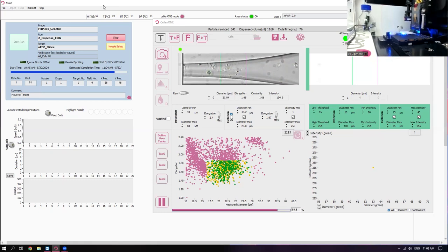It's around 300 picoliter. So every time we measure the volume, if we have a volumetric dispense of 9 nanoliters, 13 nanoliters for the trypsin, what we do is we take whatever the most recent detected drop volume is, divide the volume that is dedicated to that position by the drop volume, and we calculate the number of droplets that we need to dispense there.